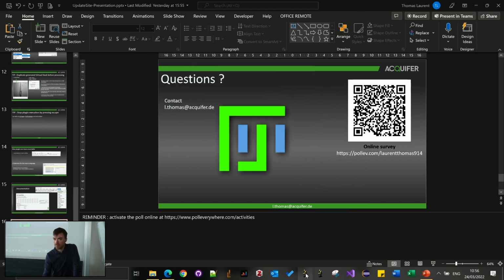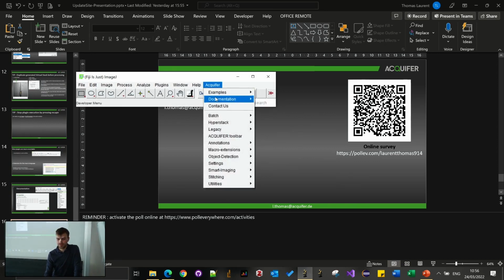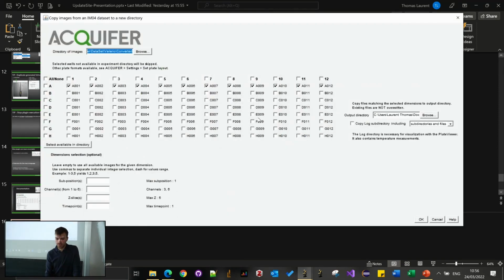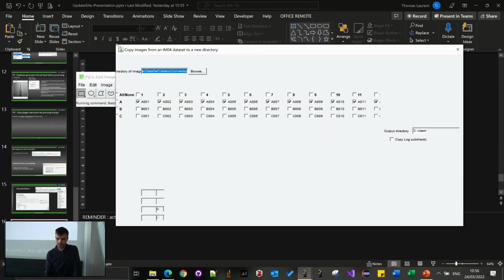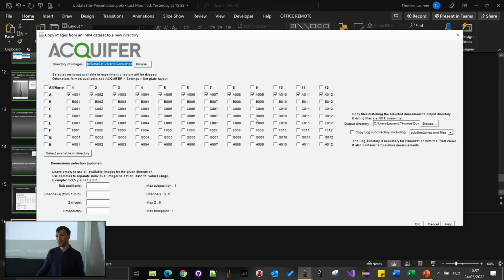Because also the create button, or whatever button that you click, is on the right, lower right, at the end, and so you always have to kind of... Yes. Maybe if that would be moved, it would be easier if you don't have to select everything on the right. So unfortunately, I cannot move the OK button. It's kind of Fiji functionality that it's always on the bottom right. Let me see now if it's a bit smaller. Yeah, not so much actually. You need a larger screen basically.